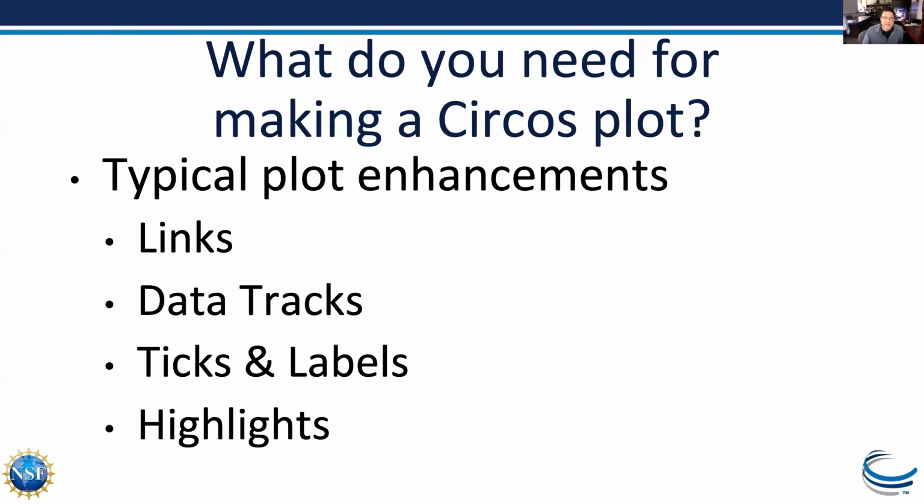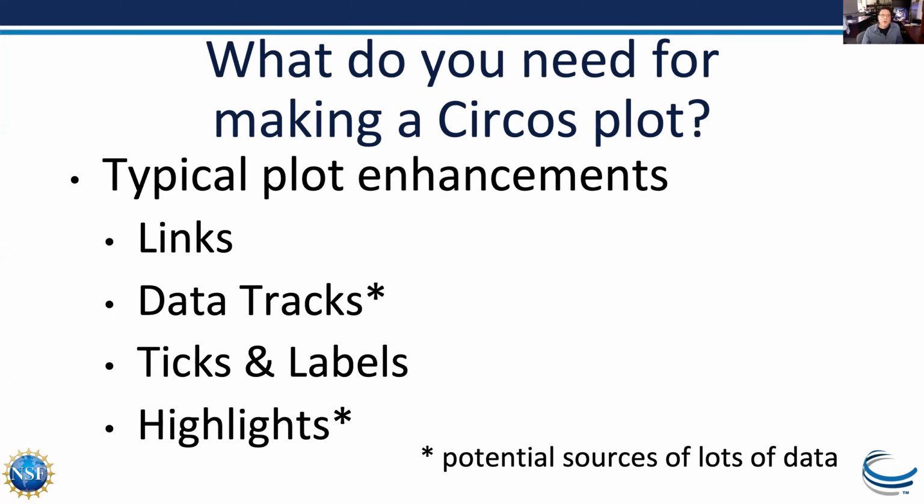But we'll see that we have a lot of resources right at the CyVerse VICE app that we're going to run here. One thing I should point out is that the karyotype and the ideogram are very summarized. The karyotype is definitely summarized data, so you're not inputting a lot of data there, but your data tracks and your highlights can be large sources of big data, and that can be memory intensive. So you have to watch out for that, and that's one place where CyVerse is going to be better than the Binder system, because you're a little more limited in Binder. If you suddenly see it stopping in the Binder system, you're going to want to be using CyVerse.